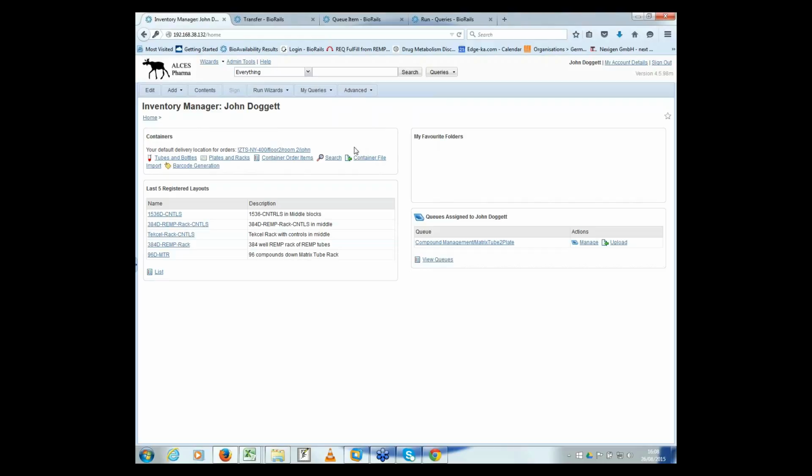Good. Can it interpret an output file, i.e. a log file, from an instrument to update the system of what it did, or does that need to be updated manually in the system as in the demo? Yeah, in the current version, there is a file-based mechanism for doing that. You can automate the operation, collect up the decrement operations that we need to do, and then just import them from a file that will update the system. We are extending the web services though to allow you to fully automate that whole procedure, so it's a lot less manual in the next version.